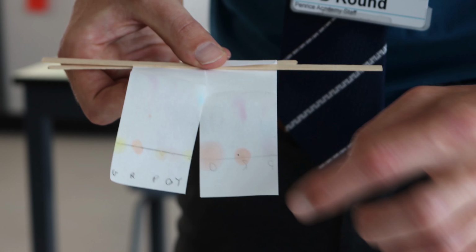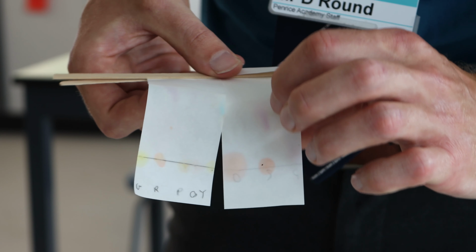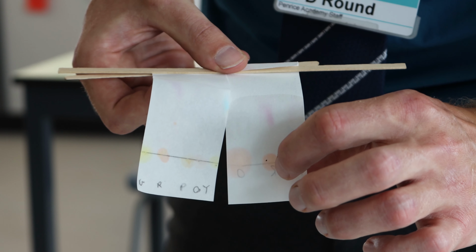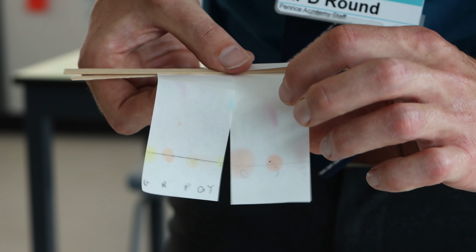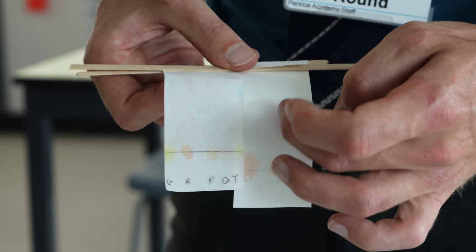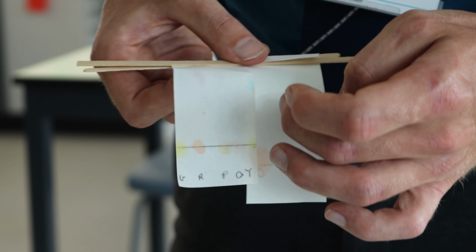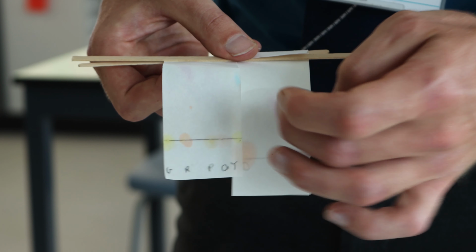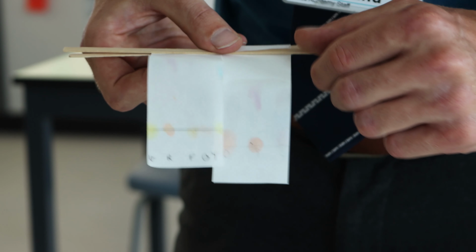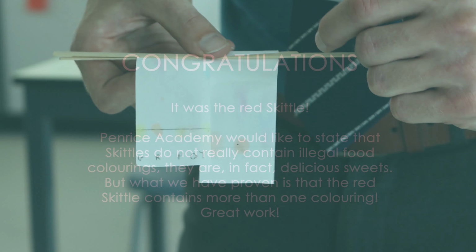Okay, Year 6. So what we can see is that the red skittle has clearly contained two different colours here. We've got an orange and we've got a pink. So we've separated out that mixture, and we can identify that one of these unknown colours is our illegal food colouring. So it is the red skittle that we should be avoiding. So you're all right to eat all the others, but avoid the red ones because that's got your illegal food colouring in.